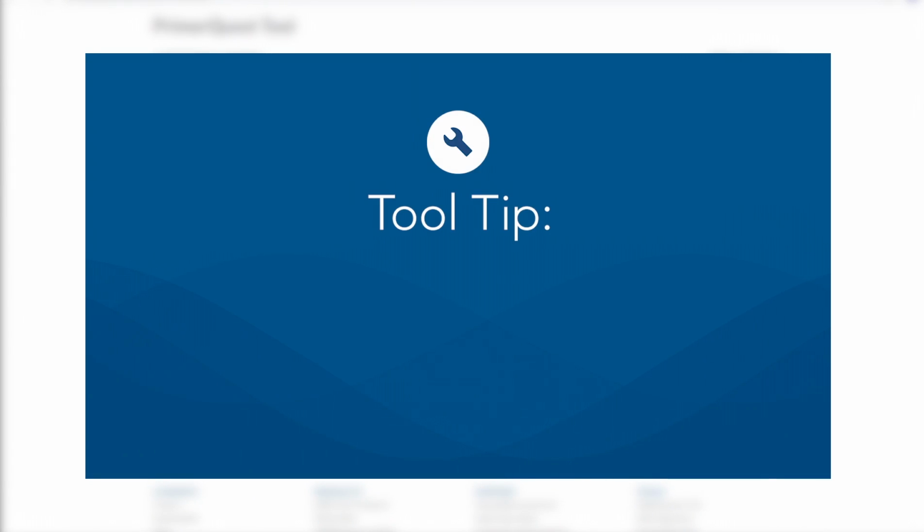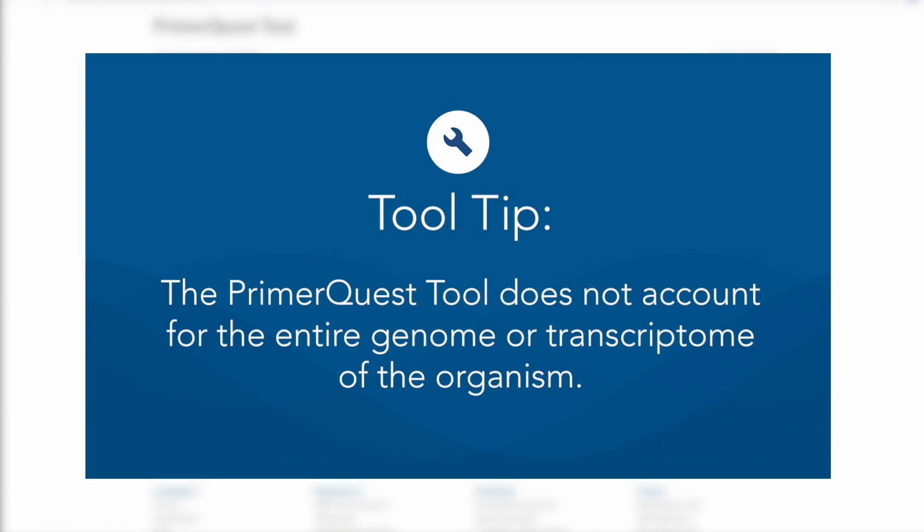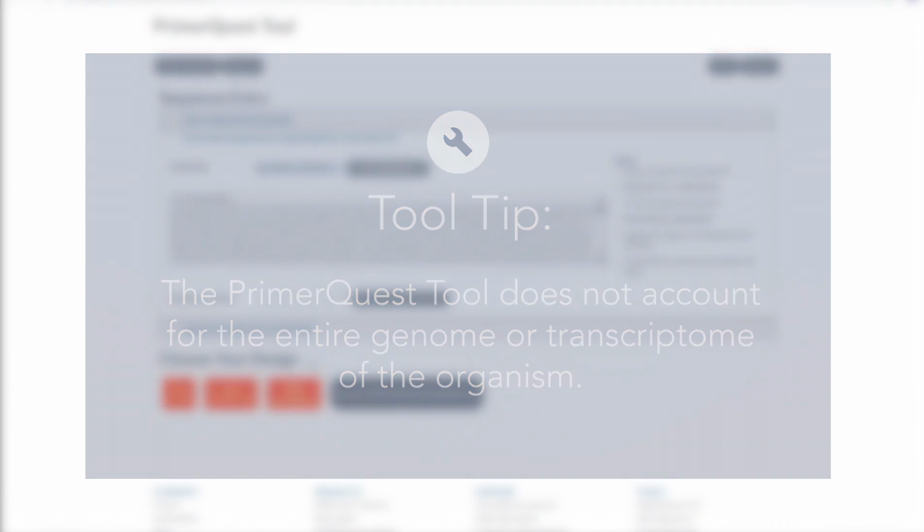Something to keep in mind about the PrimerQuest tool. It designs assays for specificity within the individual targets that you've provided. It does not account for the entire genome or transcriptome of the organism. Remember, the pre-designed qPCR tool we mentioned earlier will account for the whole genome.